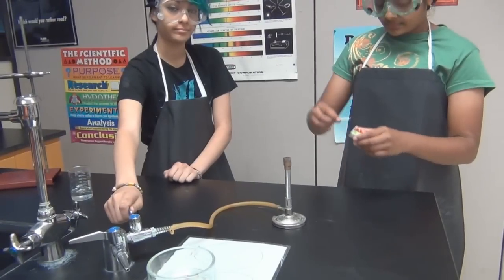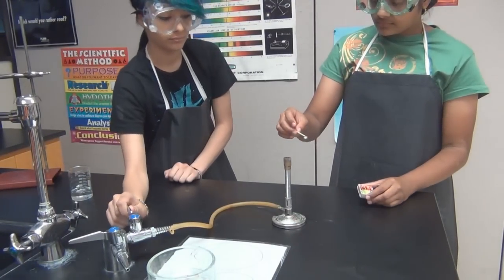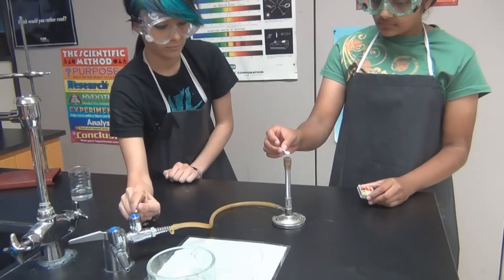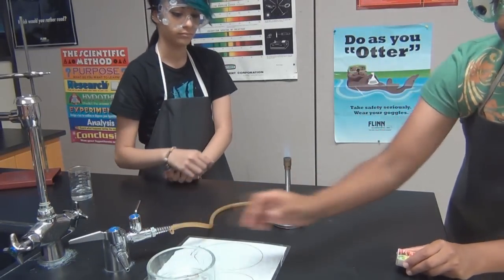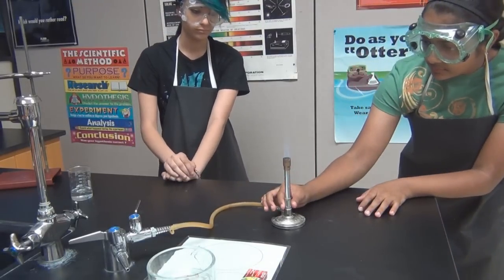How to light up a Bunsen burner and set up a ring stand. First, light the match. Then put the match over the Bunsen burner and slowly turn on the gas. Then blow out the match and put it into the used matches container. Then adjust the flame to get the blue cone.